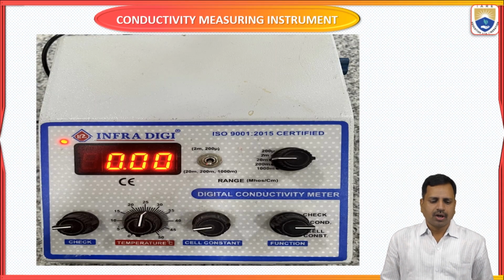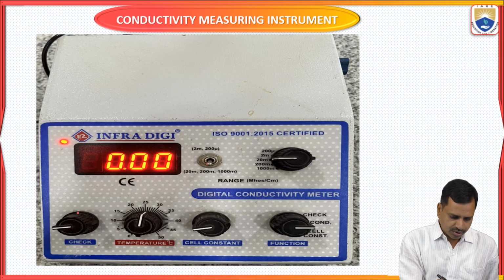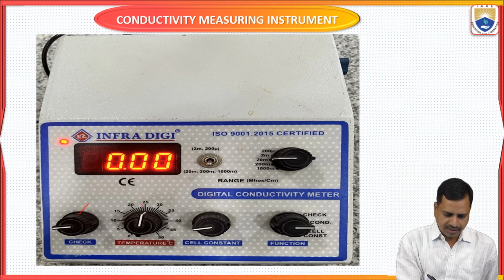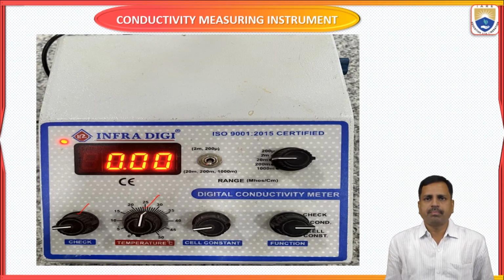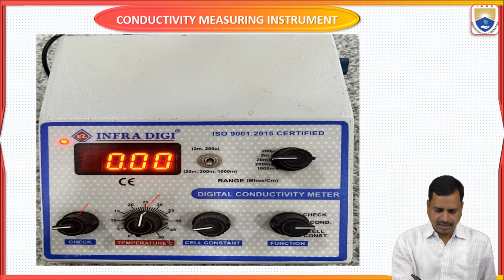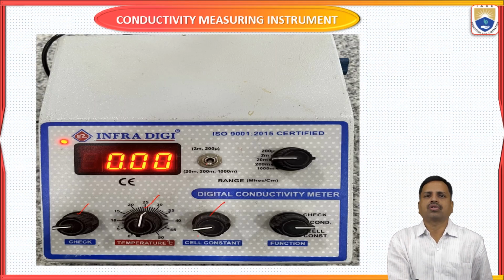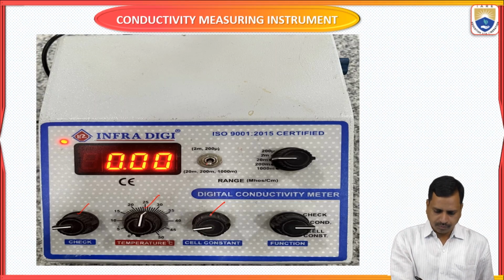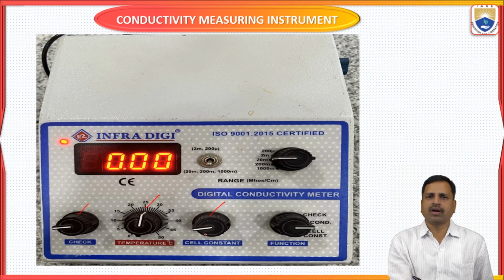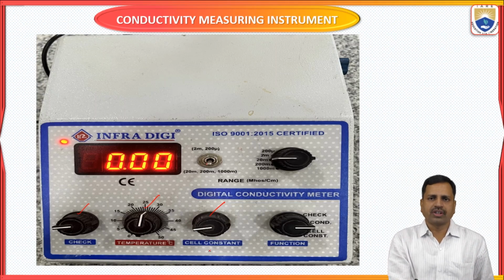So we can see this is a conductivity meter. This is a check mode and this is the temperature. The temperature is always kept at 27 degrees centigrade, and this is the cell constant. We'll always keep the cell constant at 1 in this experiment, because we use a conductivity cell whose constant is 1.